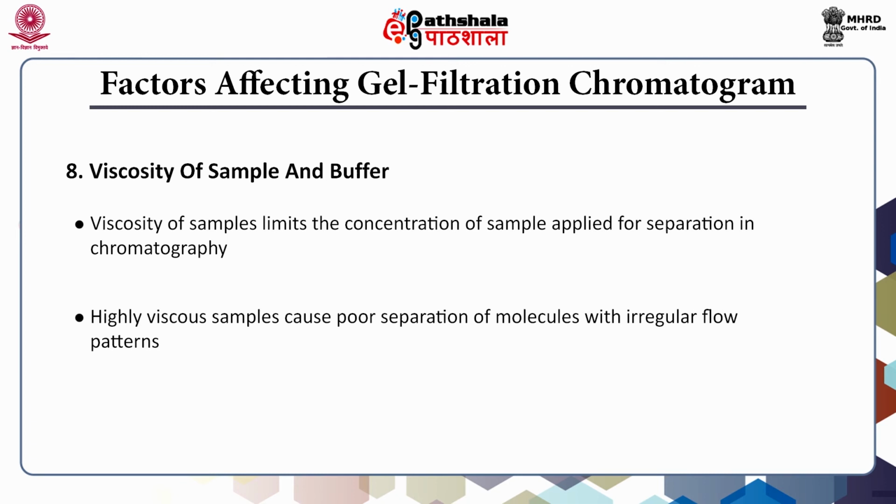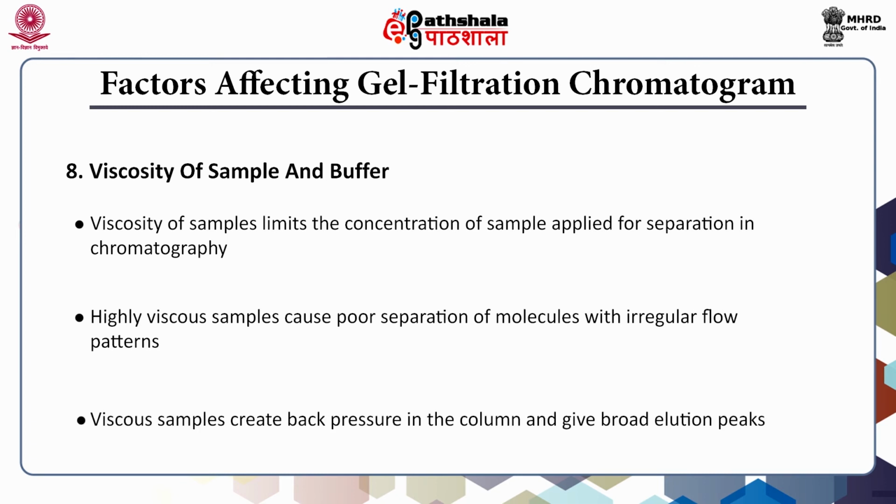In addition to that, there is another problem: viscous samples create back pressure in the column and give broad elution peaks. That is why when we are making the sample, we have to understand and measure the viscosity. It should not be too viscous, and it should not be too thin either. So, we have to prepare samples of optimum viscosity for gel filtration chromatography.